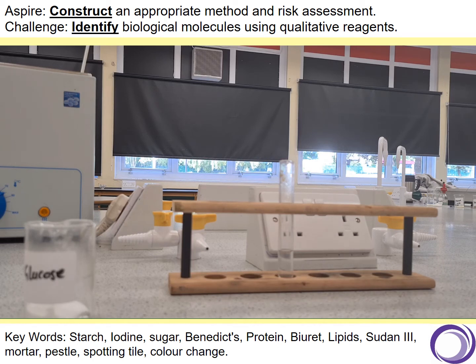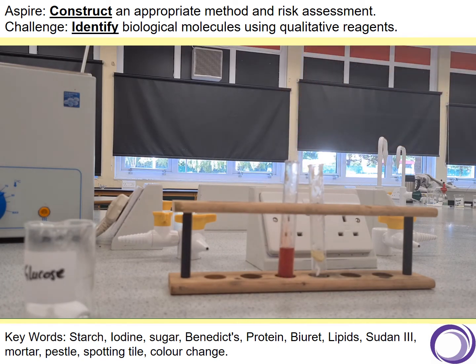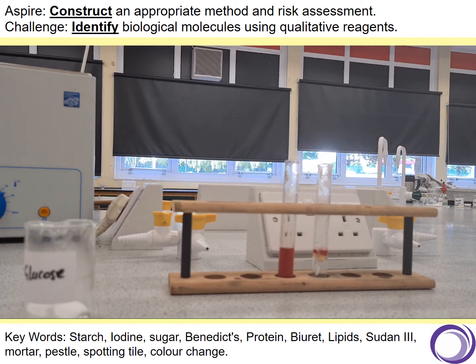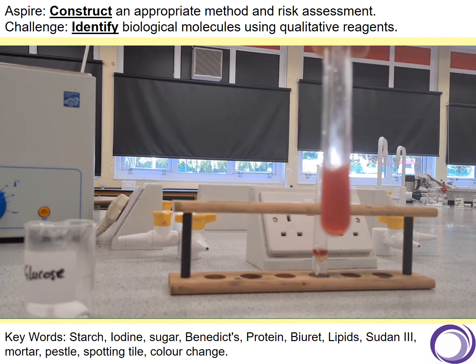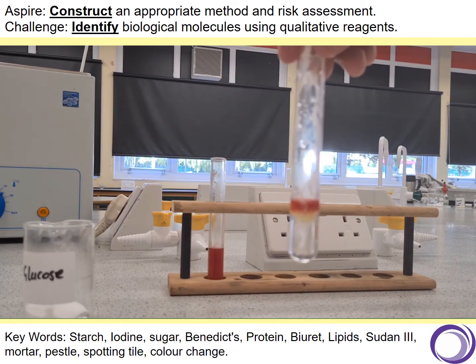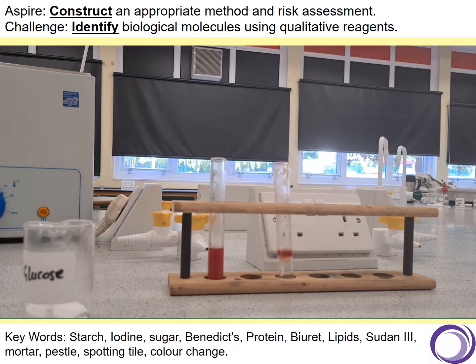And then what you will do is you add your Sudan III to the solution. So here's my Sudan III in this pipette. Add it to that solution, and then add it to this solution. And this is the difference between a fat or something that's got a lipid and something hasn't. This one does not. It's just turned the whole solution a red colour, whereas this one here has got a red band at the top. So a red band floating on the top of the solution means that it has a lipid present, and that is how you test for lipids.